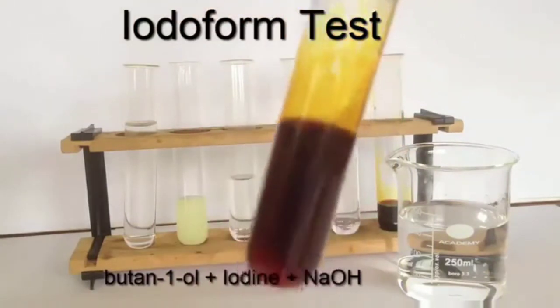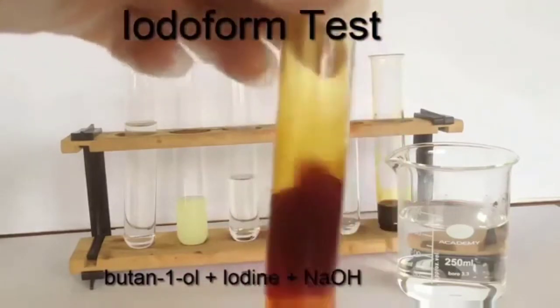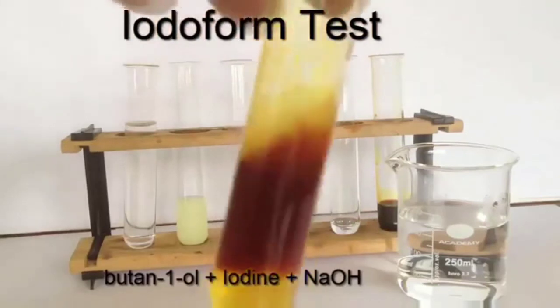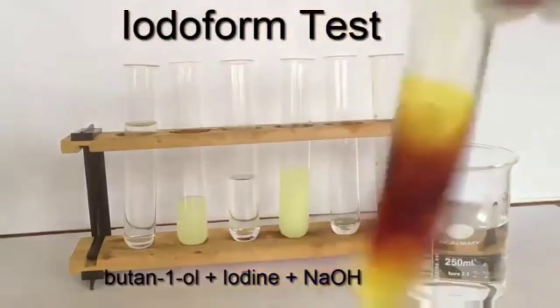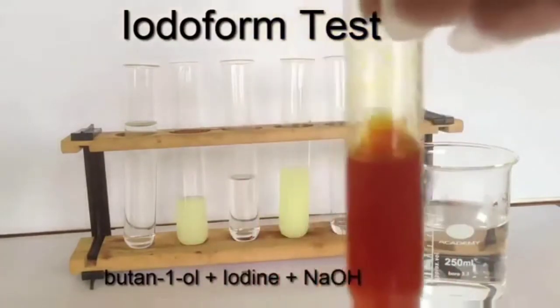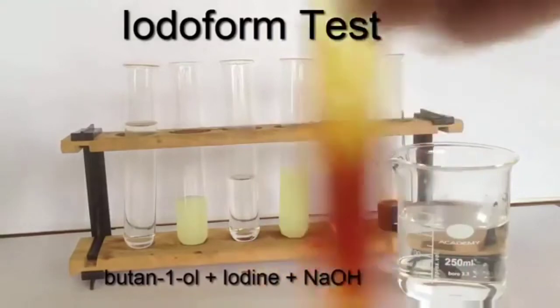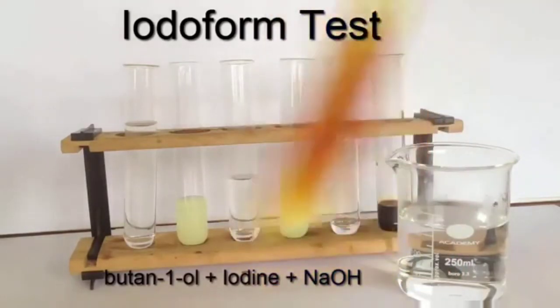So I've added about 1.5 times as much 10% iodine solution as alcohol, and I'm now adding 2 molar sodium hydroxide solution slowly with shaking. The butan-1-ol is a bit more viscous and takes a bit more shaking here. The colour is fading.